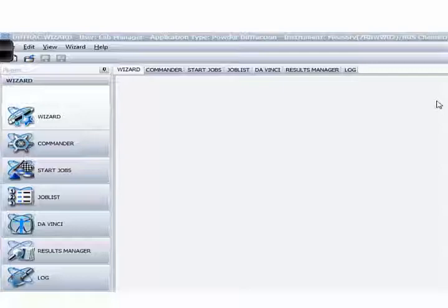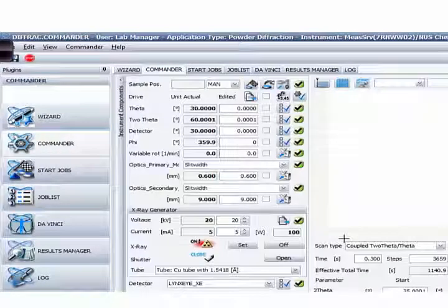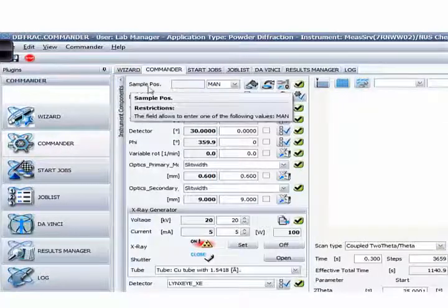This is the main measurement software. You can see different tabs here — I will go tab by tab explaining what they are and their purpose. I will skip the Wizard first and come back to it later. I'll start with the Commander — this is where you can do your manual measurement, key in your settings manually. You can see that the Wizard and Commander are incorporated into this software, so in future you don't need to open the Wizard separately. In Commander mode, you have the sample position.